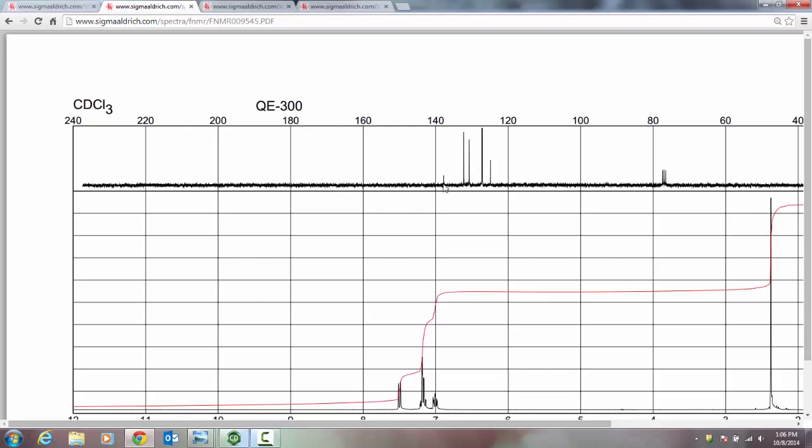With the ortho substituted, you have 2 short peaks, right here and right here. And this one, by the way, is ortho-bromotoluene. Another way of putting that is ortho-bromomethylbenzene, if that's helpful to give you an idea as to what the structure is. But these are the 2 short peaks. And then we have 1, 2, 3, and 4. Those 2 are actually together in here. But 1, 2, 3, and 4 tall peaks. And I know that's really hard to see.